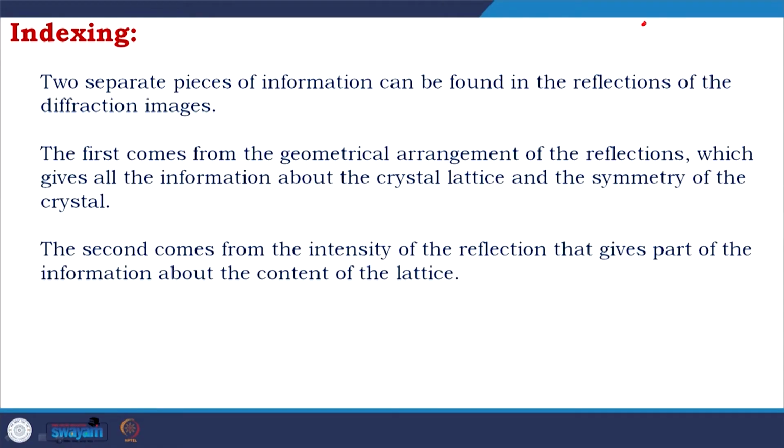Why? Let's take an example. Suppose you have a pattern like this. Now, I choose this, so most probably it looks like a cubic type of crystal.